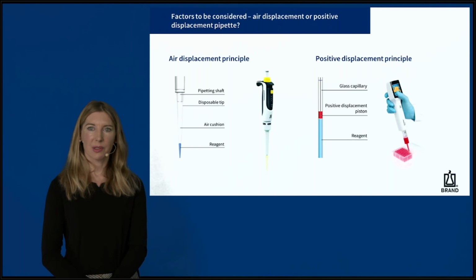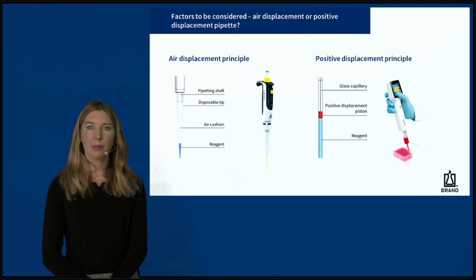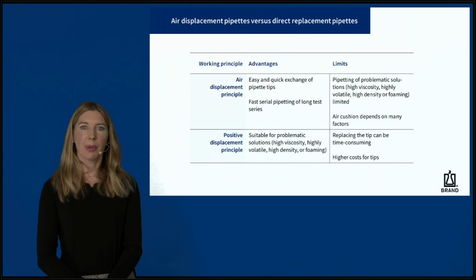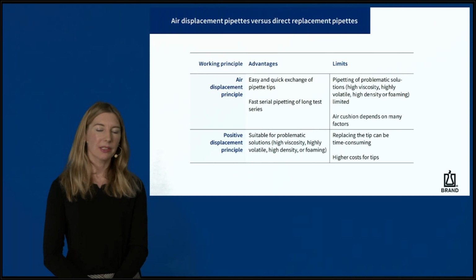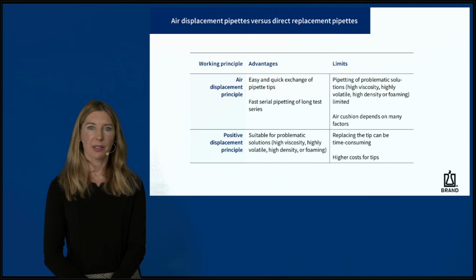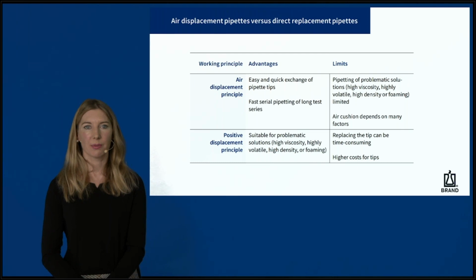The piston, which is built into the device in an air displacement model, is located in the tip cylinder in positive displacement models. This plays a role, for example, for the extraction of DNA from whole blood. In summary, air displacement pipettes are the right choice when tips must be changed all the time, as for example when adding different DNA to the different wells. Positive displacement pipettes are better for pipetting foaming or viscous media and preventing cross-contamination, as aerosol contamination can also be an issue not only with pipette tips but also when using filter tips.